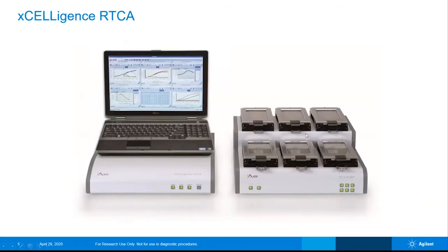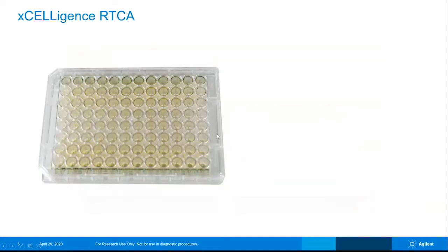So I'm showing here an example of one of the xCELLigence instruments. The line of instruments primarily vary from one another in terms of their throughput. The one shown here has 6 different cradles. Each of these cradles accommodates a 96-well plate. And these plates look very similar to a traditional microtiter plate. The difference is that they are electronic in nature.